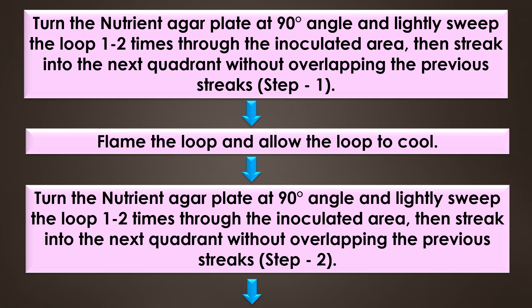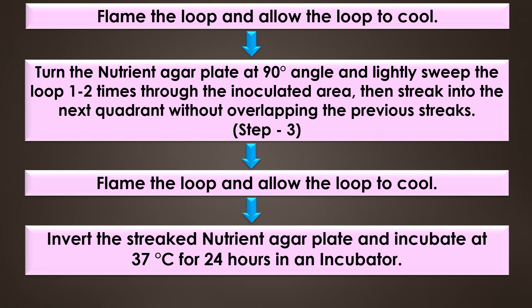After step two, flame the loop and allow it to cool. Turn the nutrient agar plate at 90 degrees and lightly sweep the loop one to two times through the inoculated area, then streak into the next quadrant without overlapping the previous streak. This is step three. After step three, flame the loop and allow it to cool. Finally, invert the streaked nutrient agar plate and incubate at 37 degrees Celsius for 24 hours in an incubator.